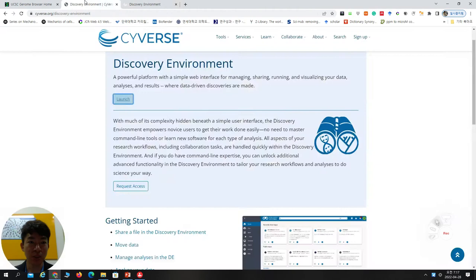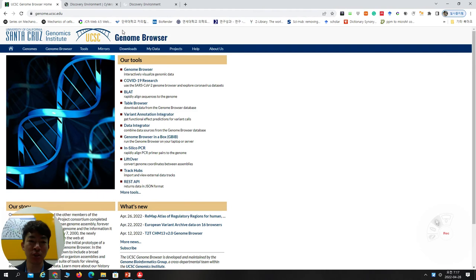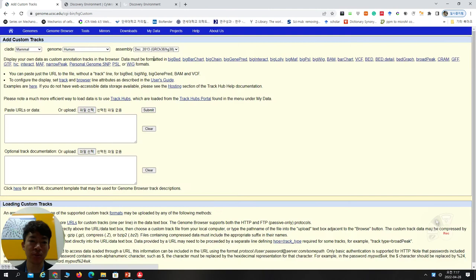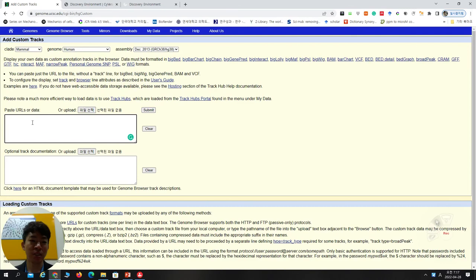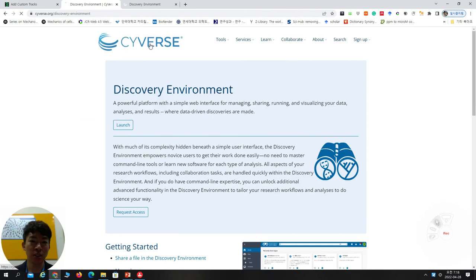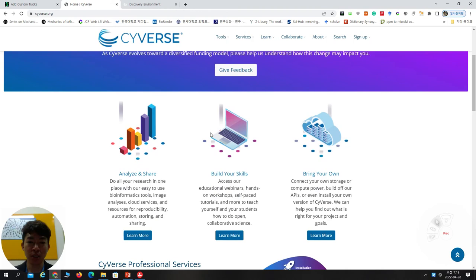So this is the UCSC browser. When you Google it, you can find it. You can see 'My Data' and 'Custom Track.' Here you can choose the genome — mouse, rat, human, mammals, other vertebrates, and so on. You can also select the assembly version — this is the most recent one. You have to put a certain URL here. For putting a URL, you have to upload your file first, so you need to go to CyVerse and create an account.